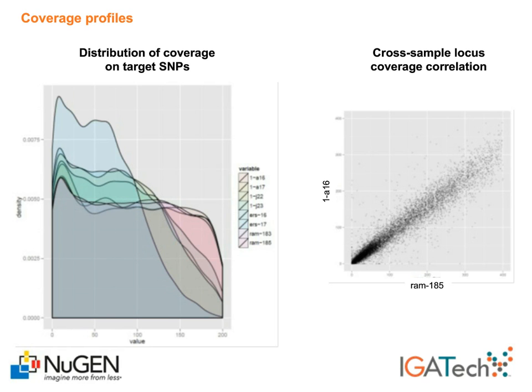Moreover, if we look at the correlation between samples, we can notice that low and high-performing probes are reproducible across experiments. Therefore, drops in the calling efficiency will always and only impact a certain subpopulation of probes, maintaining a high calling ratio for most of the others.